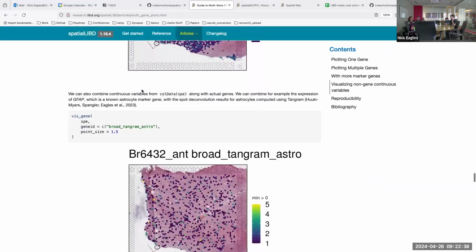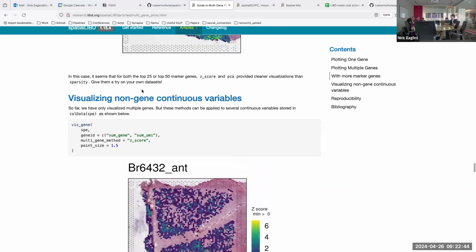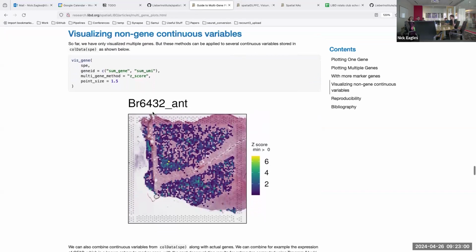And it's the average that it's plotting? The average of the combination of, if I have two continuous variables there? Yeah, it's averaging each one. Well, in this case, it's taking the z-score of each across all spots and then averaging those z-scores. Okay. That's for this, yeah. Yeah, you're right. Z-score. Thank you.